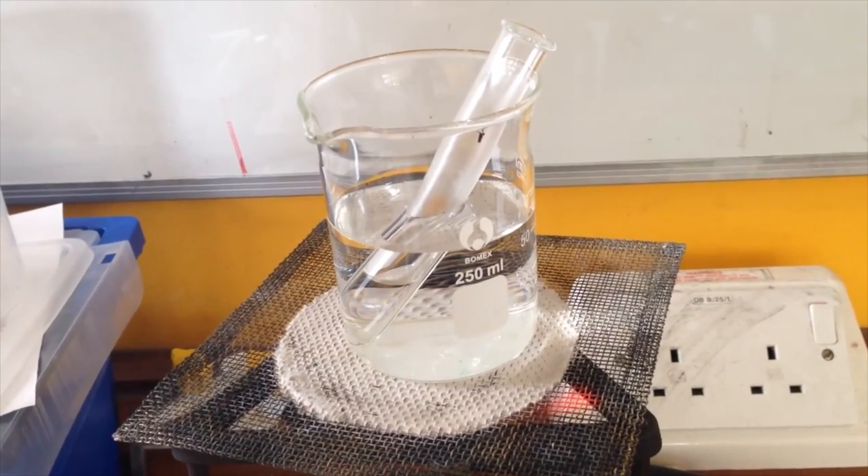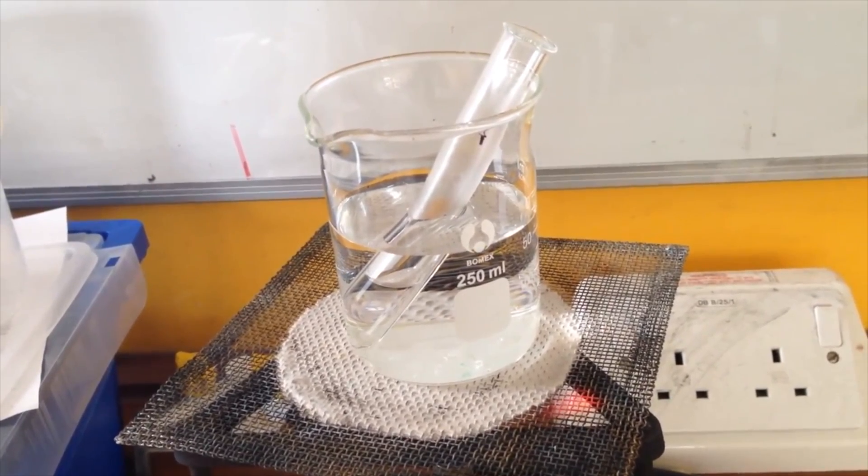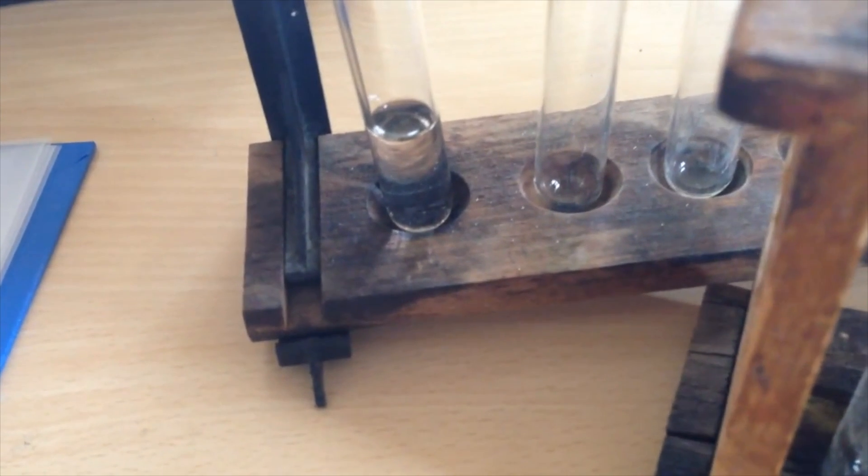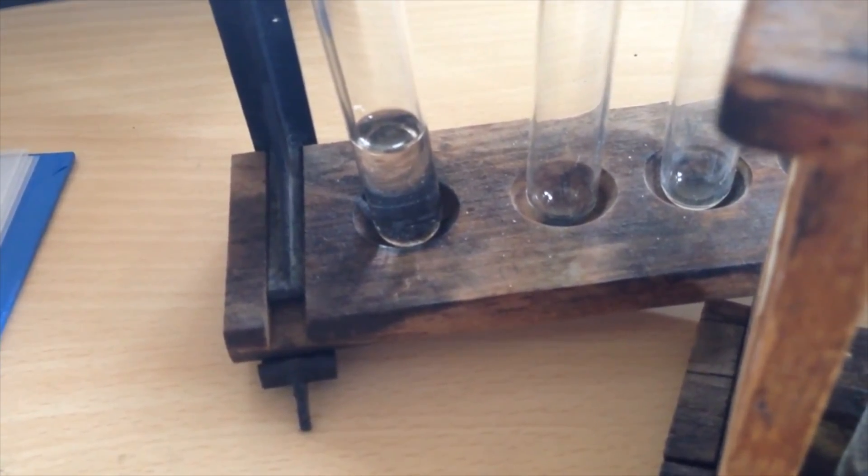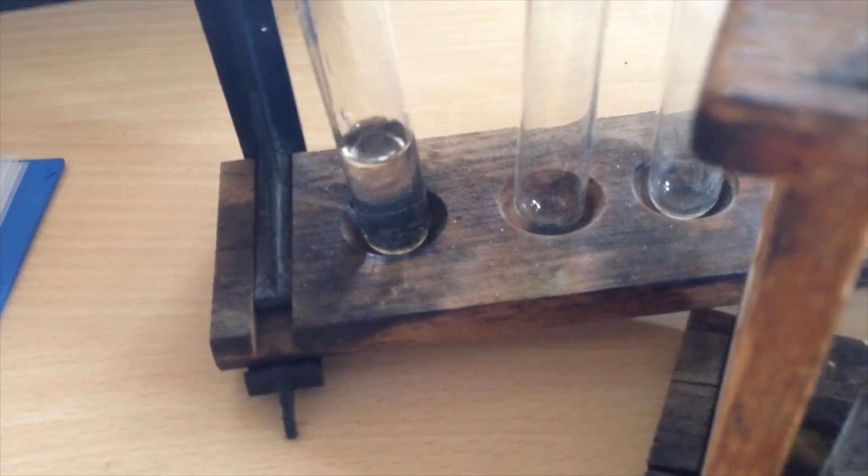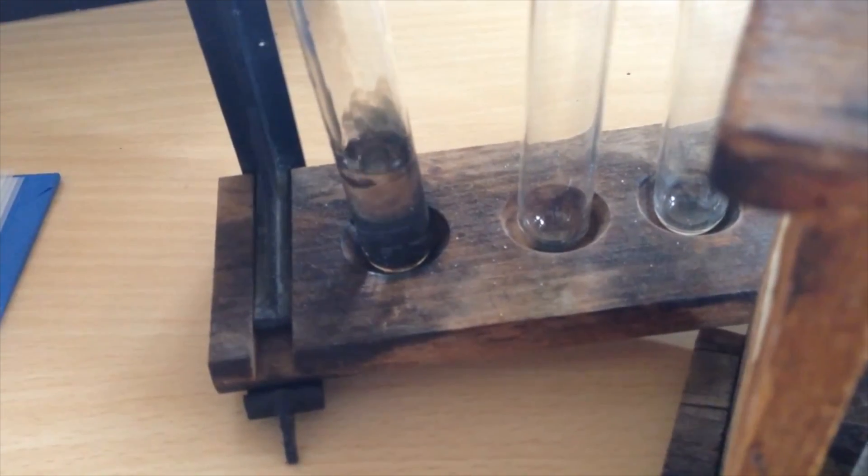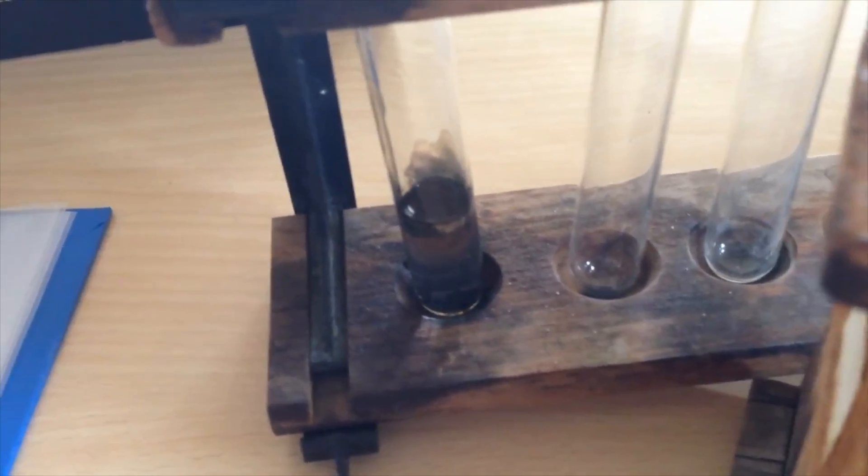We're just going to warm the solution gently for a couple of minutes. So now I have the ethanal that I've produced. I'm just going to slowly add 10 drops. 1, 2, 3, 4, 5, 6, 7, 8, 9, 10 to my solution and we'll see what happens.